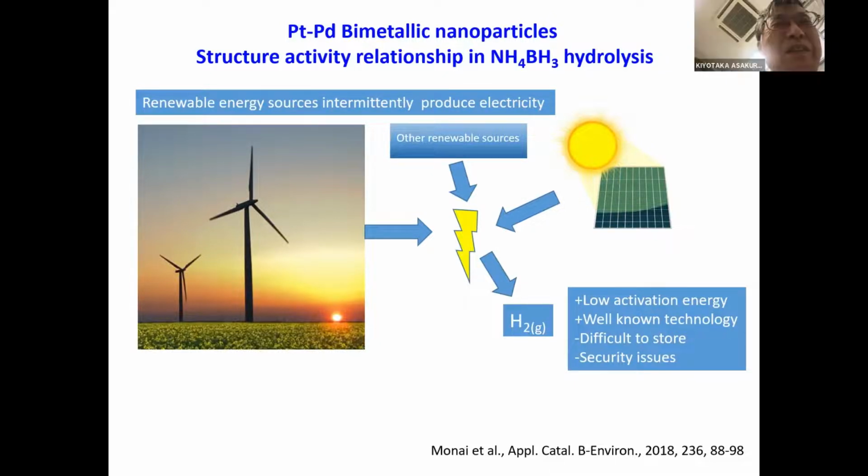Then the problem sometimes is how do you calibrate? What's your reference? We have a camera with a high resolution, but if you place the camera in a different position, probably you will not get the gain of the same setup. It will be a little bit different. So repeatability of this is checked, of course, by a camera. We put the camera at the end of the beamline, at the beginning of the experiment. It's a defocus because it's the end of the beamline, and you check that the shape is the same during the week. The question you ask is reasonable.